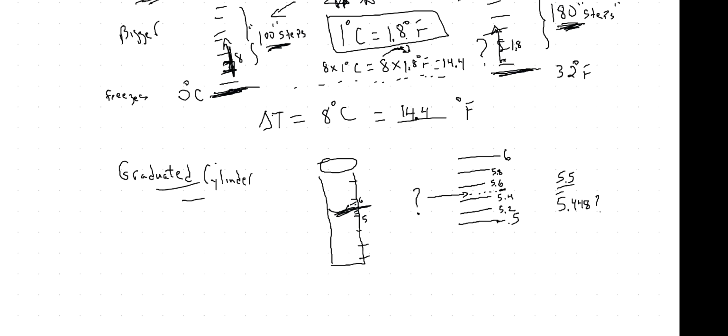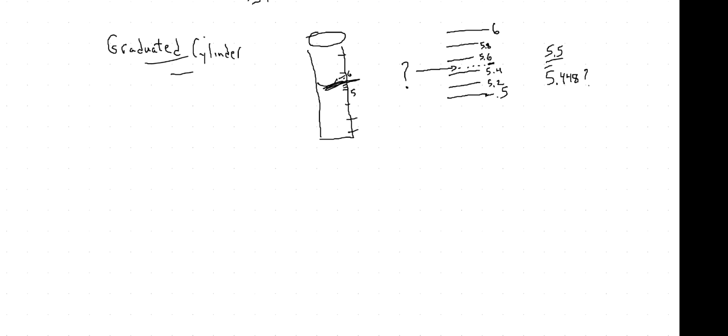All right. So let's look at the graduated cylinder for a second. If we put a liquid in, there are going to be markings here, which I don't care about right now. When you put a liquid in, you'll see it does something like this. I'm sorry, it's not so neat. The liquid, whatever we put in, is going to make this kind of U shape, and it's going to stick to the sides. Since this is usually made of glass, and inside we have our liquid, water or whatever else, we have a liquid sticking to glass.